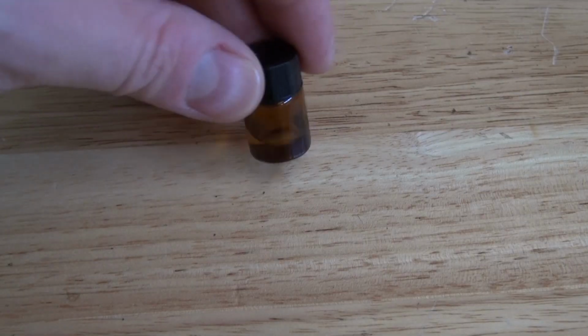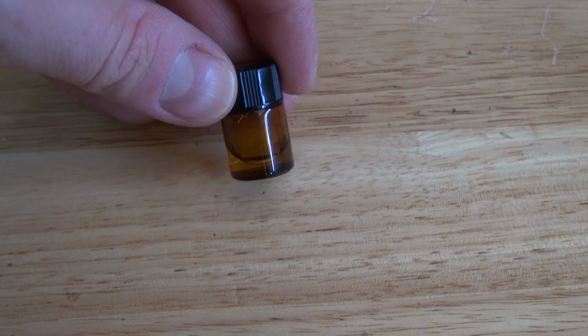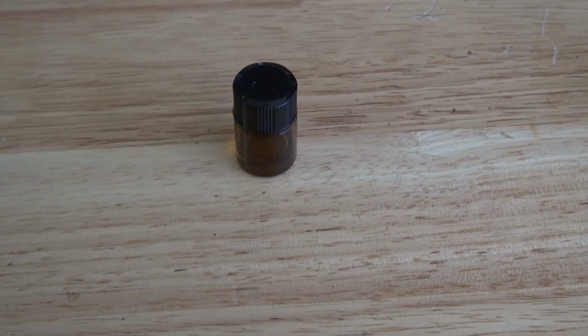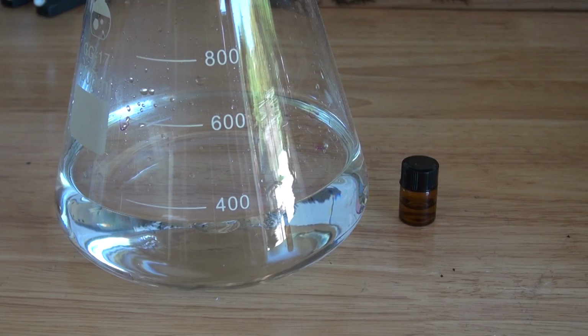And there we have it, this project is now complete. As you can see, I've collected concentrated rose hydrosol with a lot of the rose essential oil in it, and I've managed to collect 400 milliliters of pure rose hydrosol. And there you have it, now you know how to make rose water and concentrated rose water using just a simple chemistry distillation apparatus.